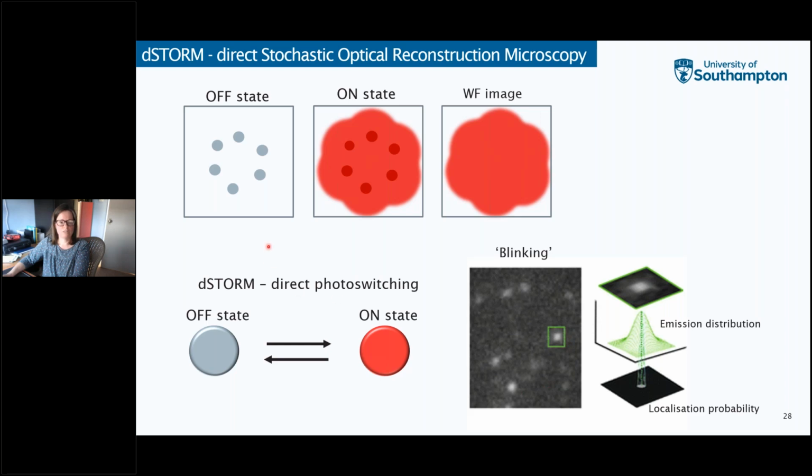So this means that on a conventional light microscope, if we take an object which is less than 200 nanometers in size, such as, for example, this ring-like structure, we just see the object as a large blob and are unable to discern that it is in fact a ring structure. If we could have the particles of the structure emitting light one at a time, it would help to discern the underlying structure. And this is the principle of dSTORM microscopy.